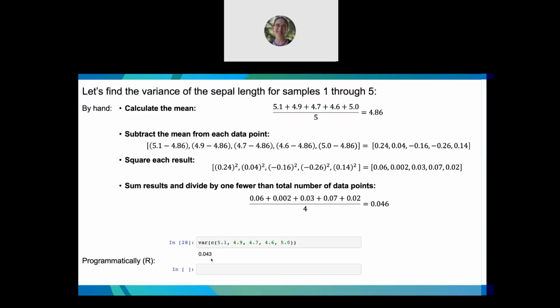Yeah, exactly, Rashi. It's rounding, because I'm just one person and I can't be responsible for saving digits out to the 20th or 30th place. So I rounded everything. But R has the luxury of being a computational program and doesn't have to do that. So that's another good reason to do all these calculations programmatically rather than by hand.